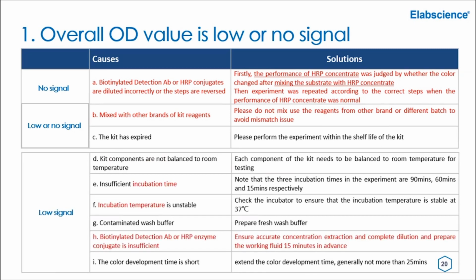Sometimes the plate is not completely colorless. It has signal, but very low. For this case, there are many possible causes, and I listed them here. Most of them are improper operation.